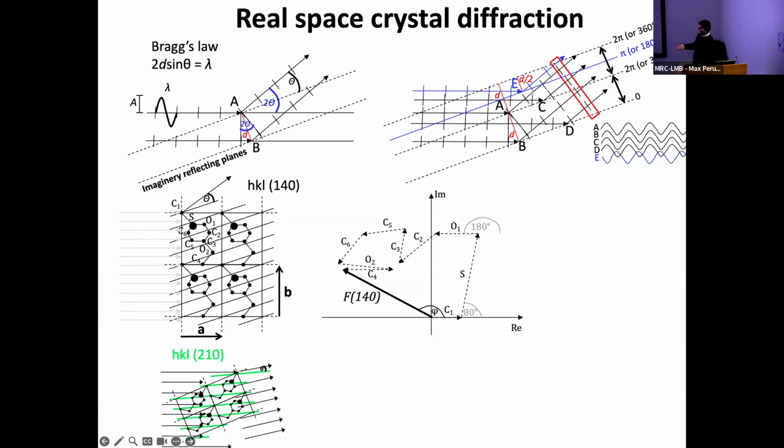So in this case, we can do the same thing. Our structure factor looks like this. Depending on how the atoms are arranged within the planes of that family, you're going to have different combinations. So you might have a longer, stronger amplitude, and different phases.